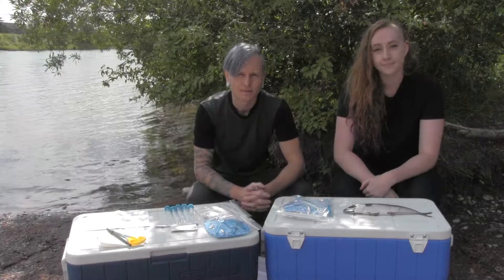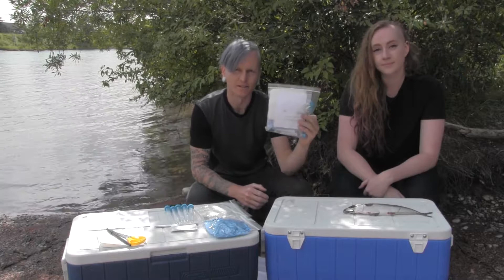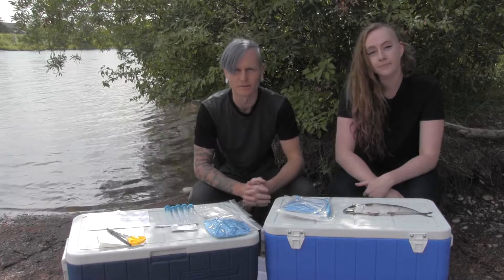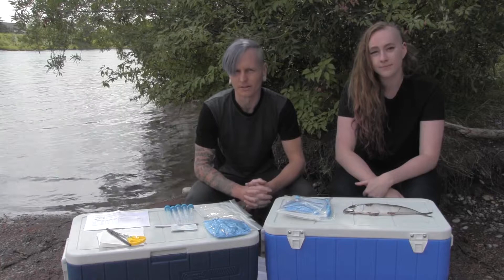To take a DNA sample from a finfish you'll need two things: a DNA sampling kit — ours looks like this, but yours may look slightly different — and you'll need a finfish. What fish is appropriate for a certain study will depend on the study, and the written instructions in your kit will tell you what species the study you're involved in is targeting.